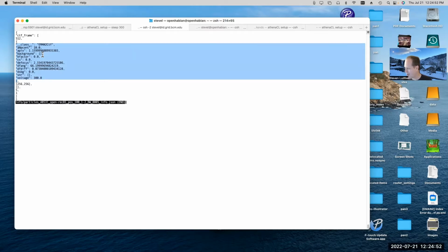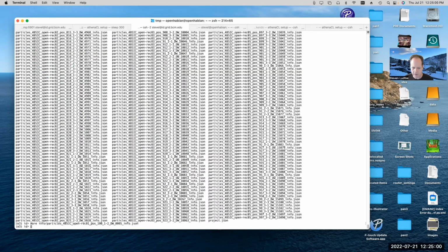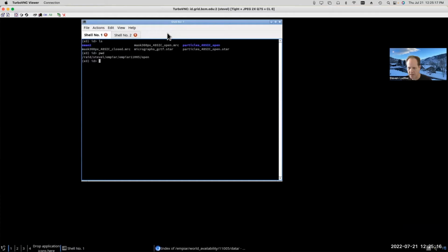So you can store any sort of arbitrary information that you want in one of these JSON files, which is a real limitation of the star file format. In the star file format, all of the information you store has to be tabular data. And that's fine for certain types of things, but there's certain types of metadata that you might want to store in a cryo-EM project, which you can't conveniently do. So let's maybe take a little aside and take a look at one of those.